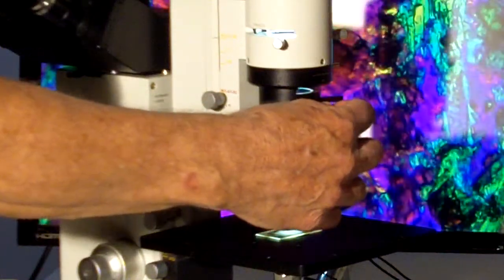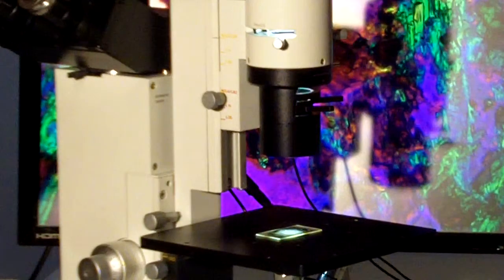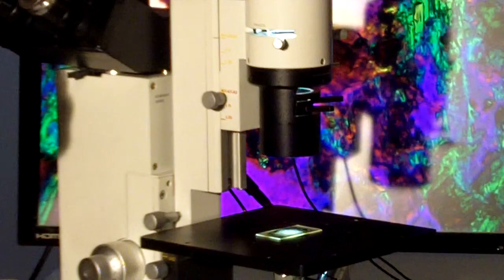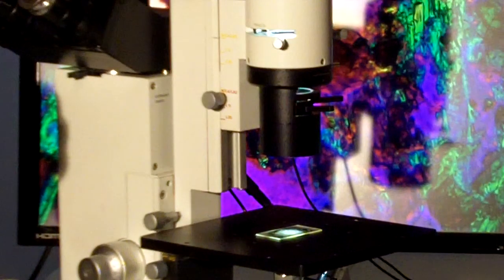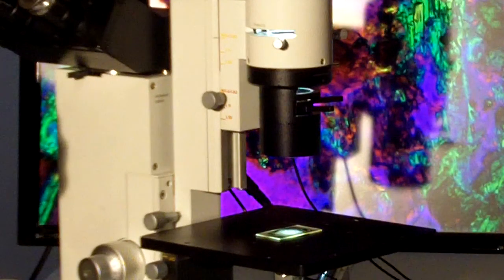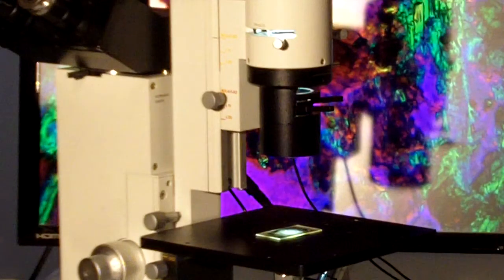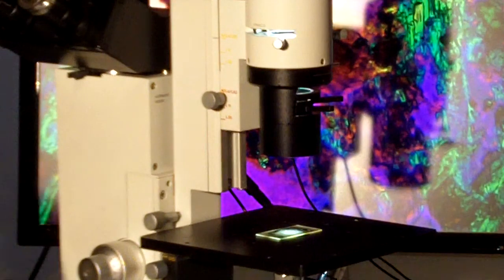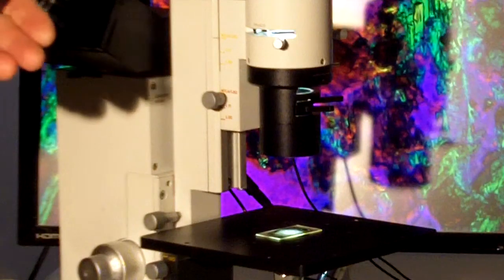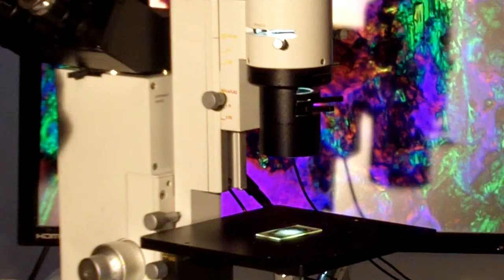We can cross and uncross that. And of course geologists and professionals can use these methods to check out the birefringence color properties of mineral samples and make identifications just by the color of the mineral when it's in cross polars with a first order red compensator.